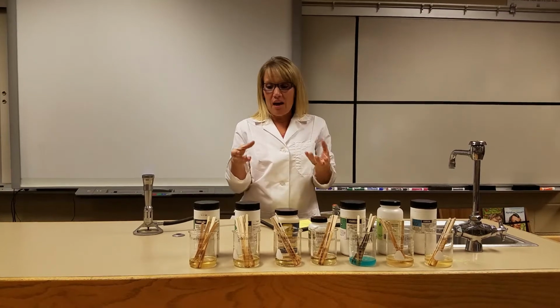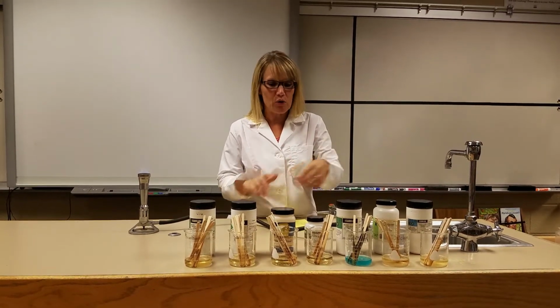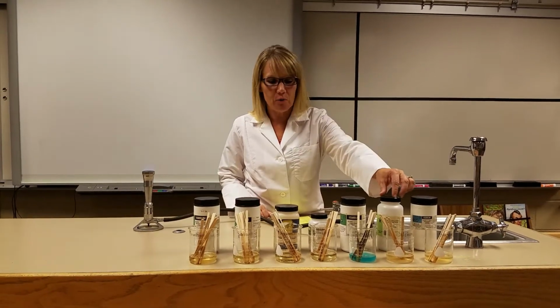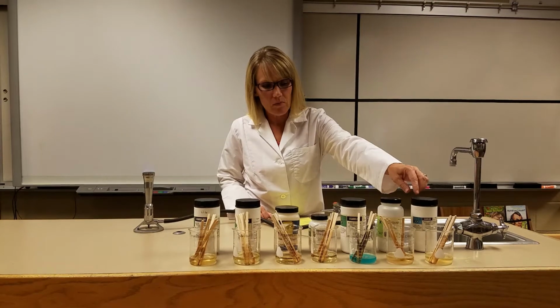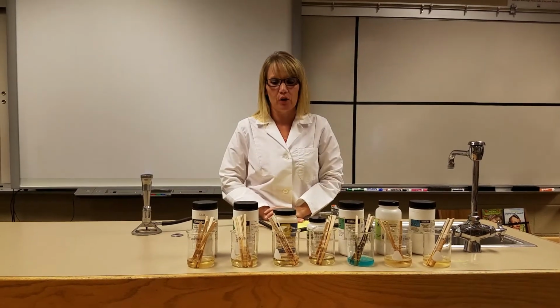And if I just had those out, they're basically all white powders with the exception of cupric chloride. And I mix them with water to form these solutions. And you can see that they look very much the same. It's hard to tell which one is which just by looking.